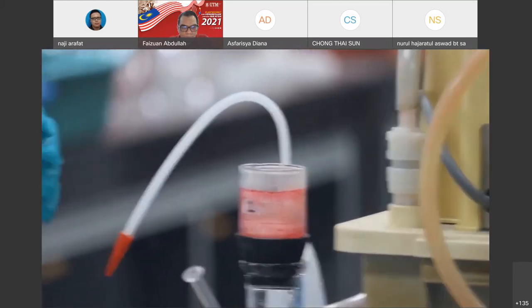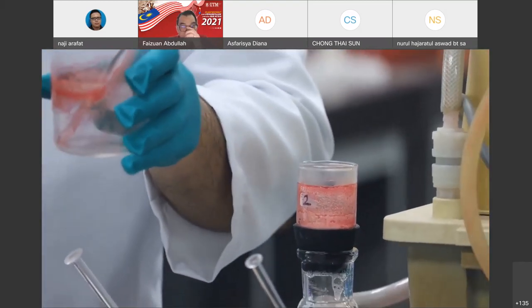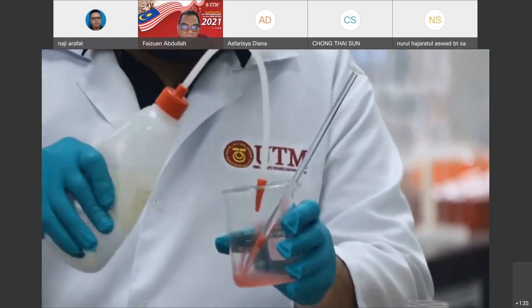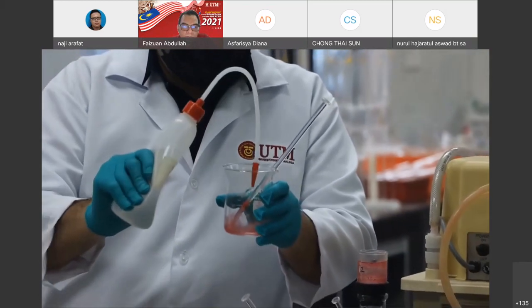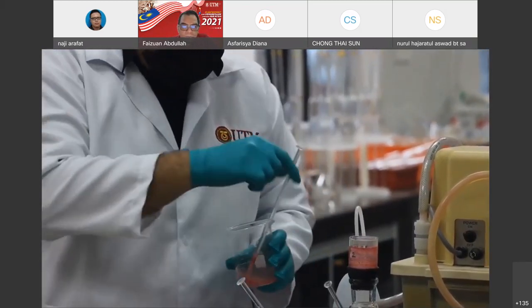I'm going to run some distilled water through the crucible to wash the precipitate in order not to miss any solute from the calculation later on. So this is very important to ensure that you have as accurate a result as possible.